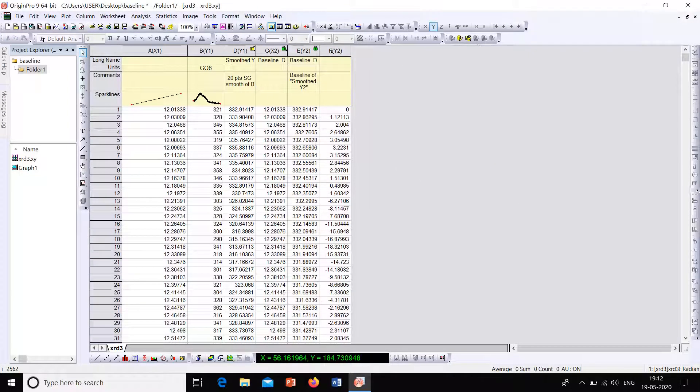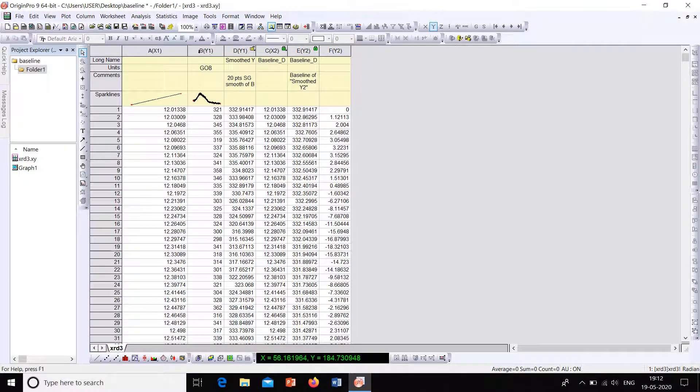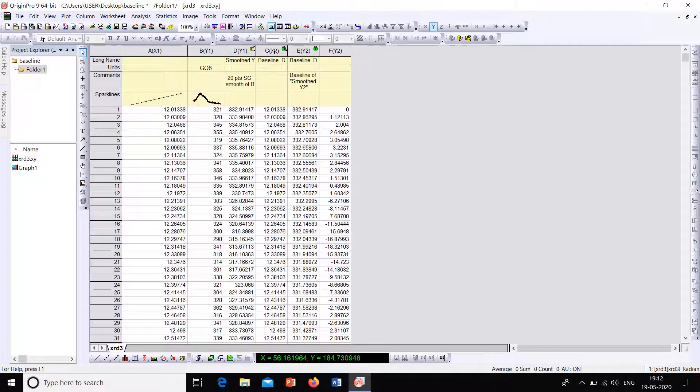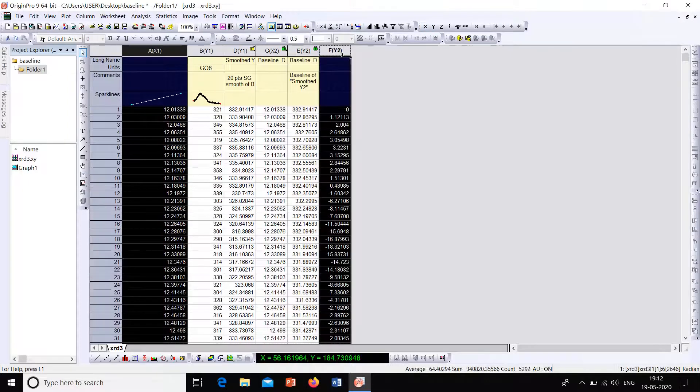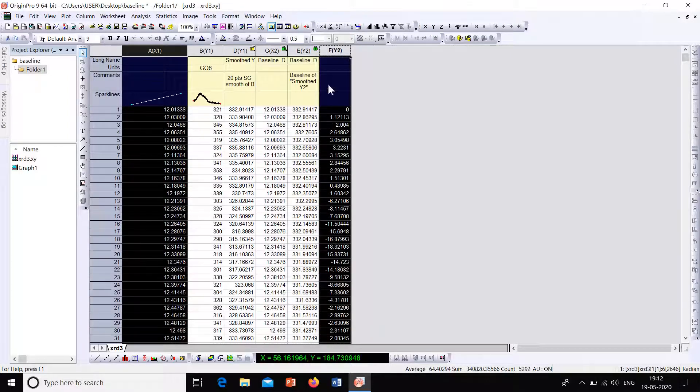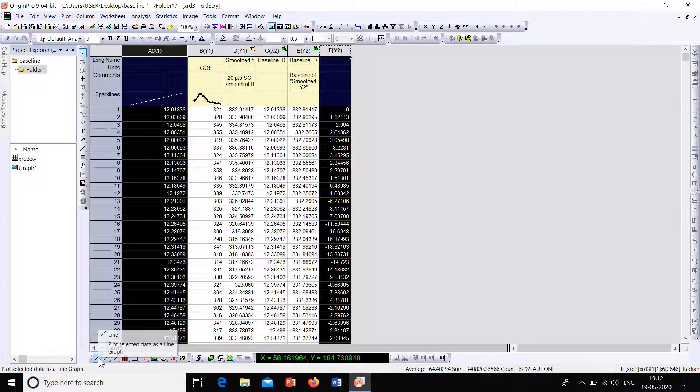So this F value is the original plot which is already corrected with baseline. So now let's plot them and see how it looks like. So for that select the X axis and select the baseline corrected values. Now plot the graph.